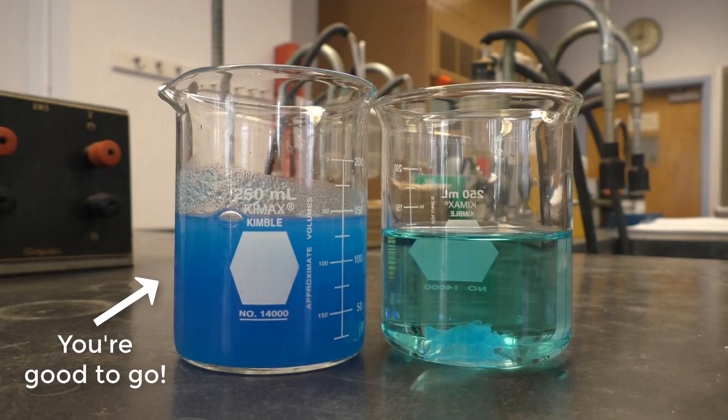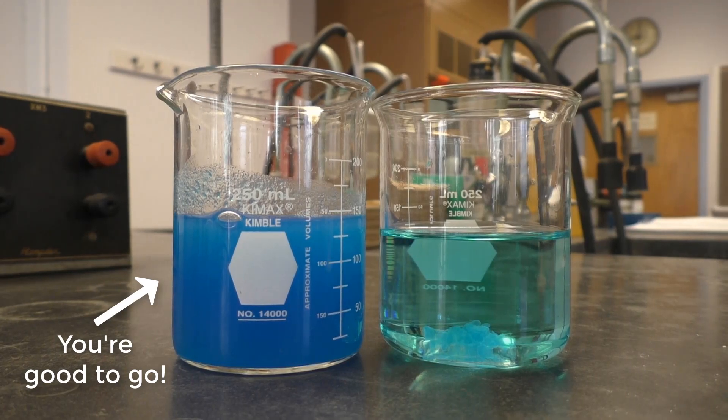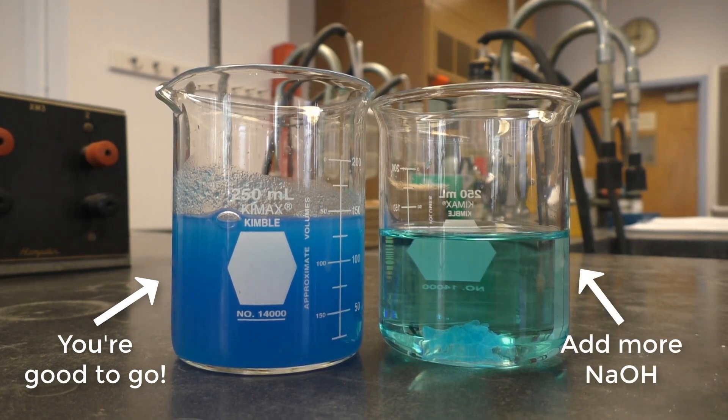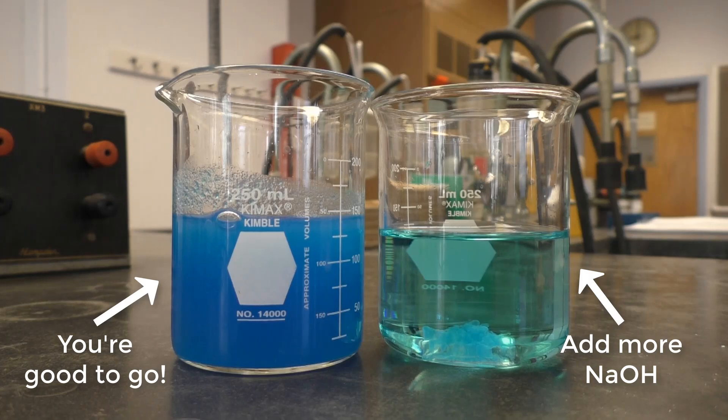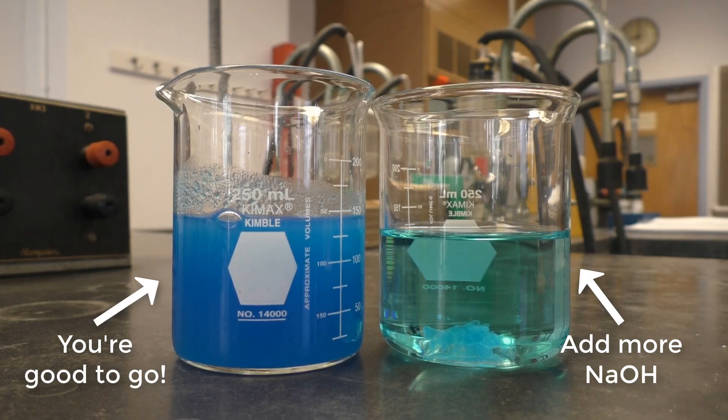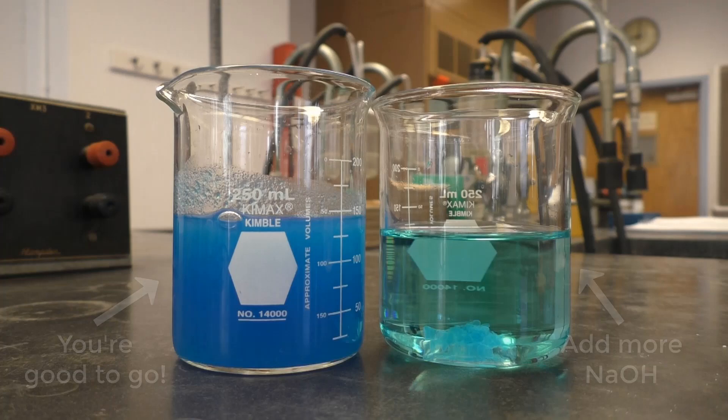If instead of a deep royal blue opaque solution, you get a more translucent teal or baby blue color, don't panic. All you have to do is add more NaOH in 10 milliliter increments until you get the desired product.